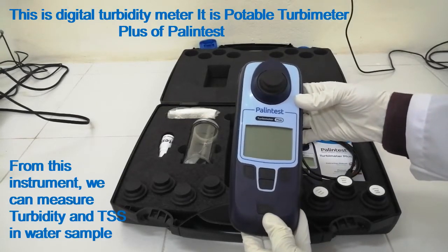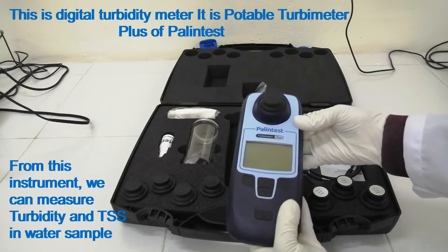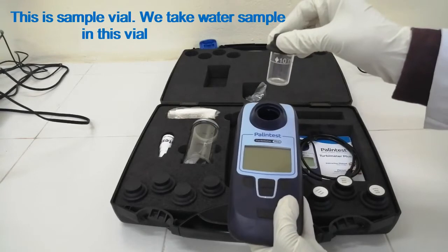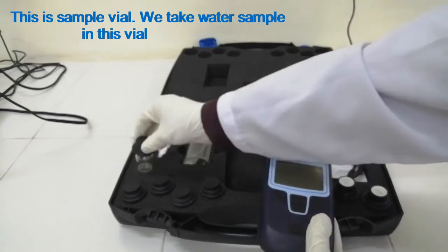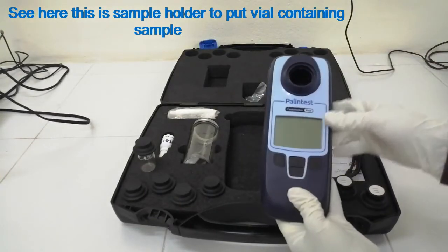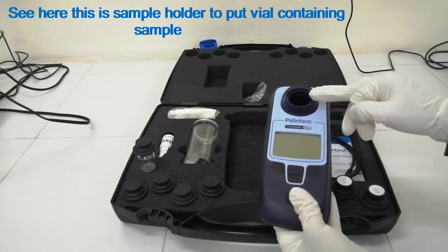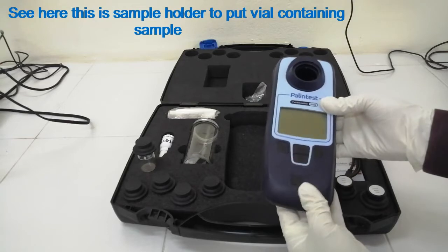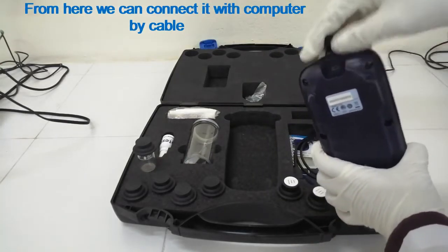From this instrument, we can measure turbidity and total suspended solids in water samples. This is the sample vial — we take the water sample in this vial. This is a sample holder to put the vial containing the sample. From here, we can connect the instrument with a computer by cable.